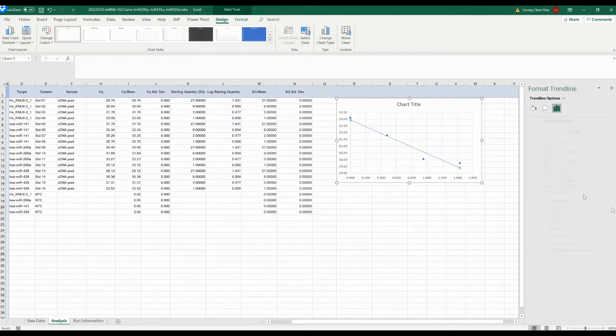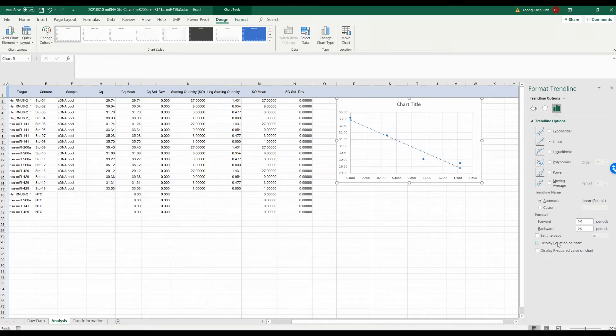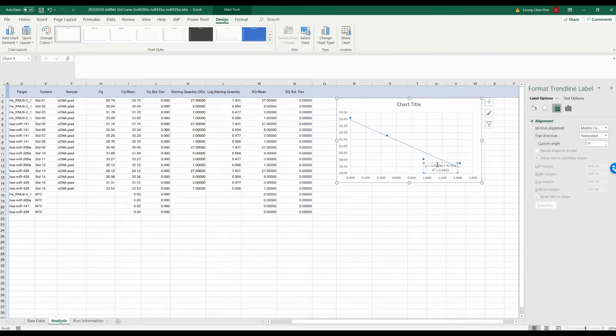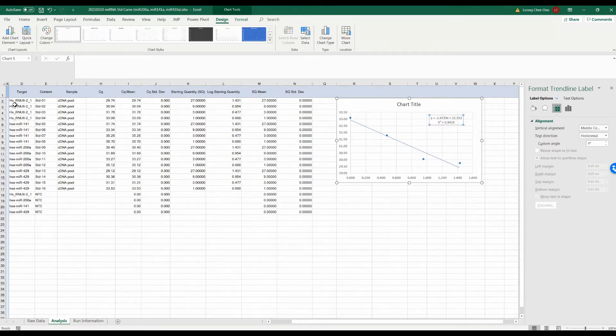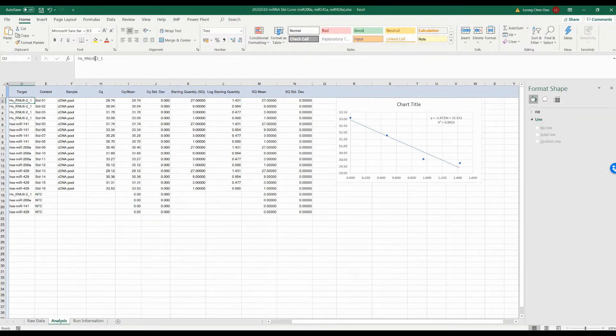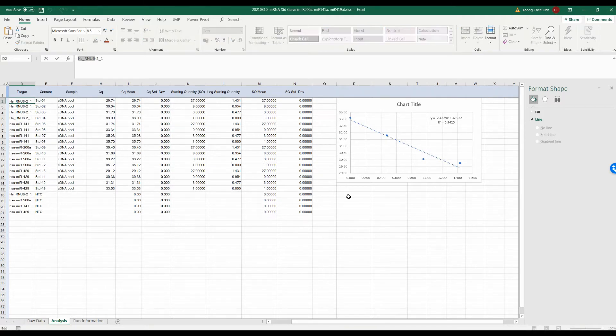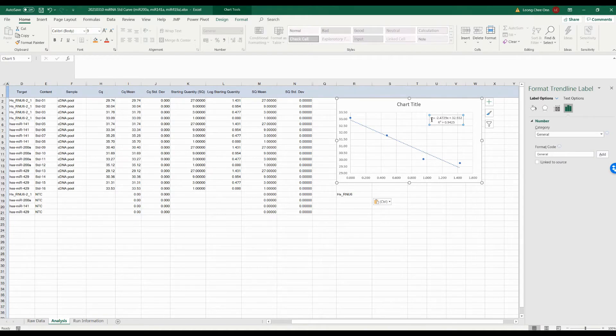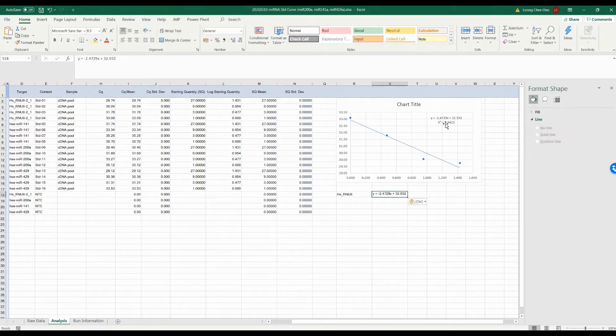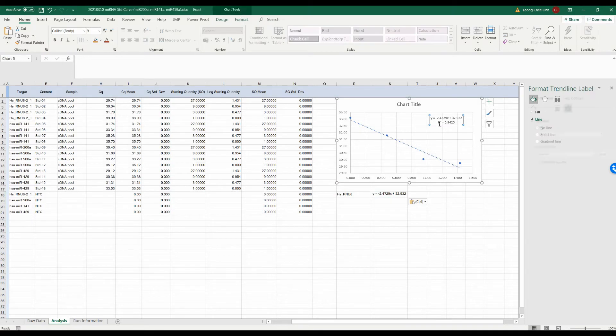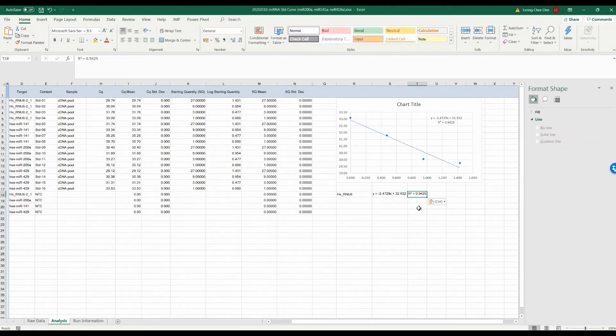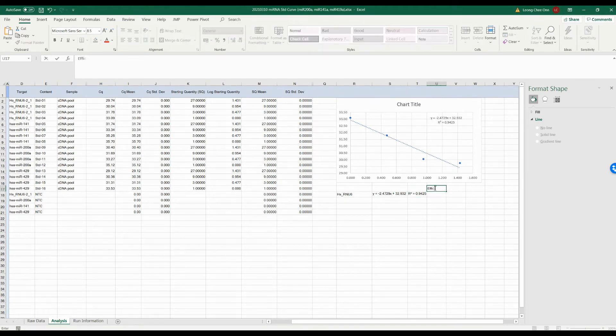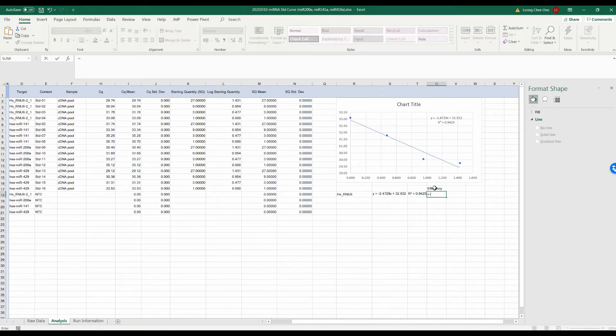The R-square represents the correlation coefficient and should normally be more than 0.95 and above. The slope of standard curve indicates PCR efficiency. You can use the formula as shown here to calculate the PCR efficiency. The efficiency of the PCR should be between 90 to 110%. If the efficiency is 100%, the CQ values of the 10-fold dilution will be 3.3 cycles apart, that is a two-fold change for each change in CQ. If the slope is below 3.6, then the PCR has poor efficiency.